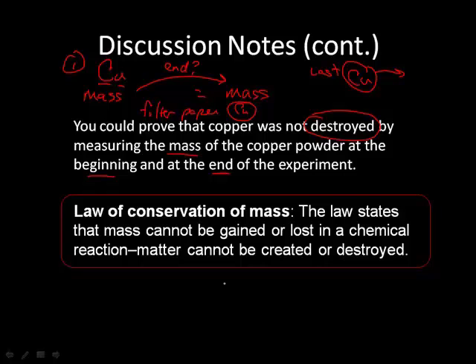Now, little amounts of copper were lost along the way. This could have been because of spills or measurement errors or the copper getting stuck on filter paper or even in the beaker. We had to clean up a little bit. Nevertheless, mass is still conserved. Even if the original copper didn't end up in the beaker at the end, it exists somewhere.